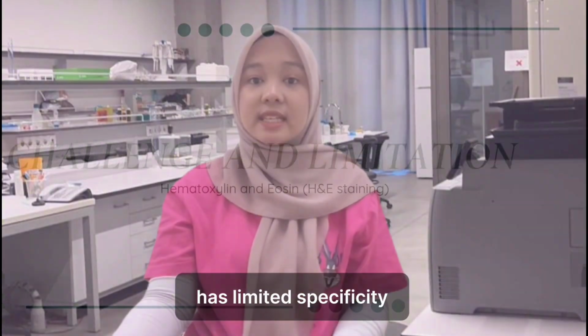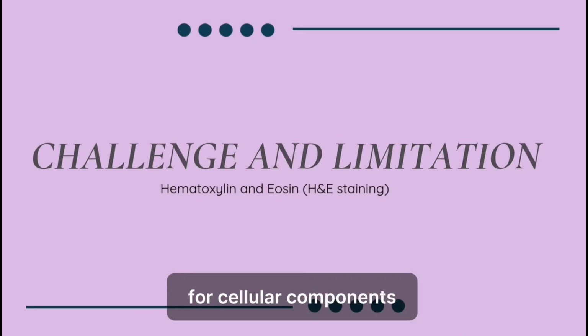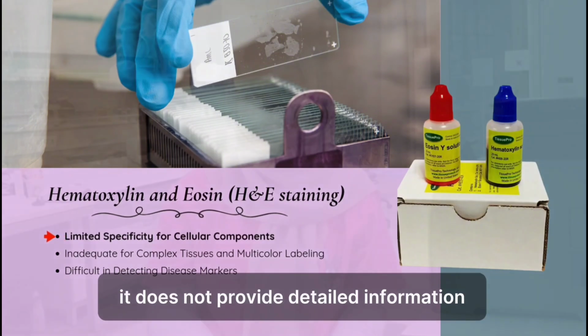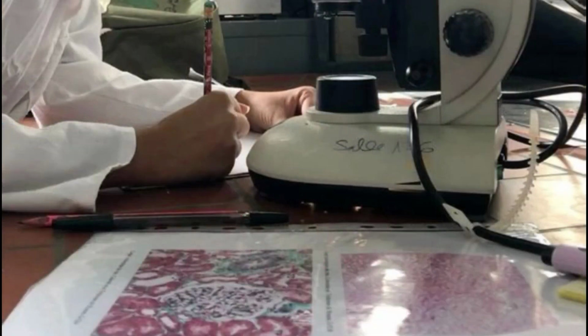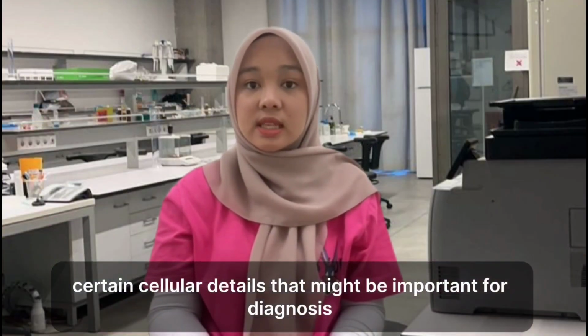Firstly, H&E staining has limited specificity for cellular components. While it's useful for general cell structures, it does not provide detailed information about specific molecules or structures within the cells. This limits its effectiveness in identifying certain cellular details that might be important for diagnosis.